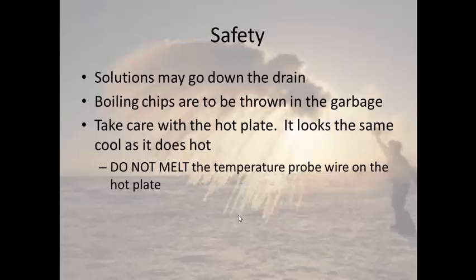Be careful with the hot plate. The hot plate surface does look the same cool as it does hot. And this is the most important thing. Please do not melt the temperature probe wire. This has happened before. Make sure you keep that temperature probe far away from the hot plate surface.